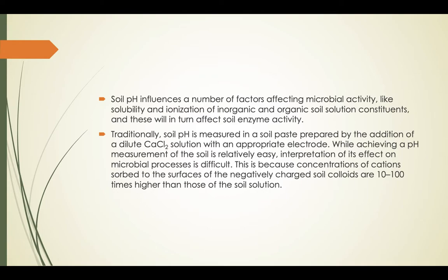There are two types of soil sampling. The first one, which is not really scientific, is you just get a sample in your particular land or particular soil area.